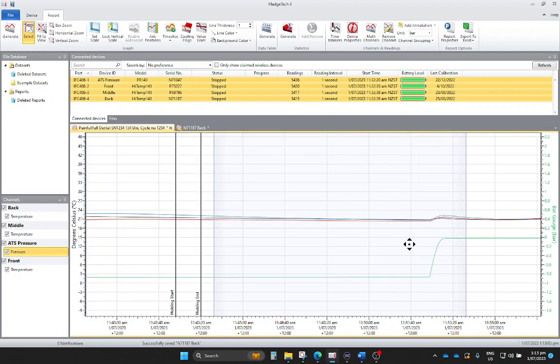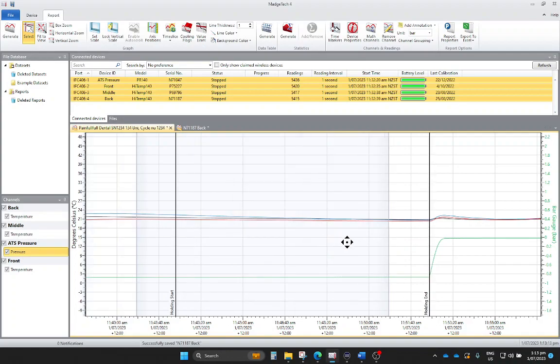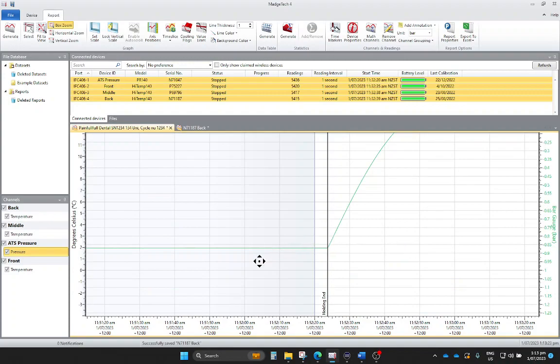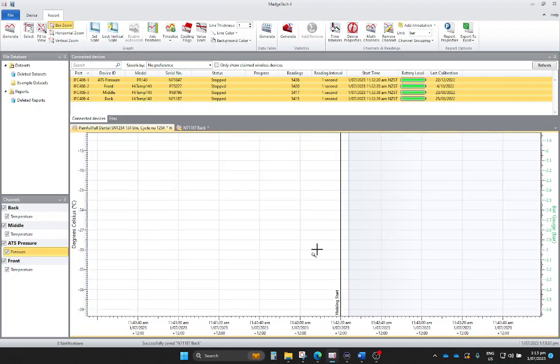So let's just move that way, and I can click and drag that and put that there. I can bring that back there, and I can zoom in. In actual fact, I got that bang on first time. And I can hold the control key in the wheel and just zoom out like that, and zoom in on the bit that we're interested.